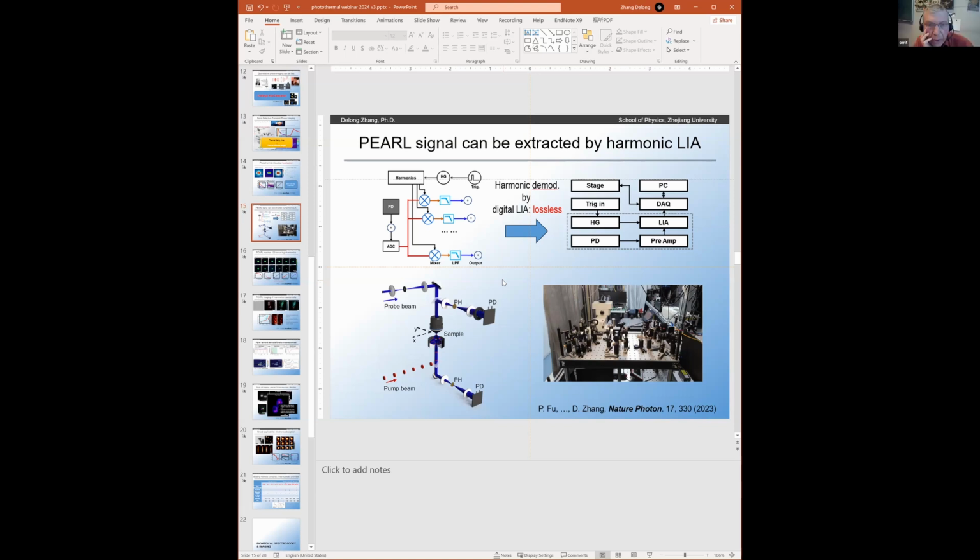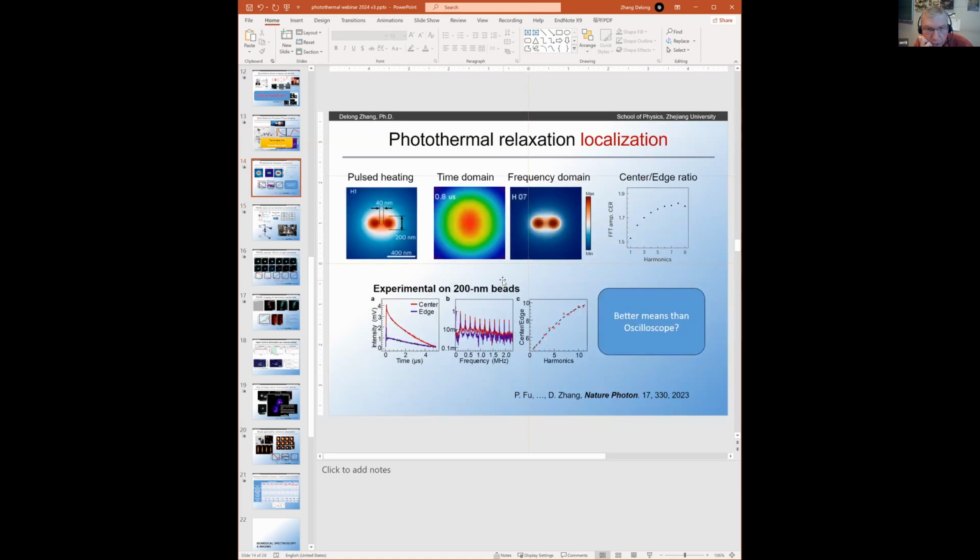Right. So I think the question was about the excitation mode, and your figure here on the slide shows that you have pulses of pump excitation. You have short pulses. Yes, very short pulses. So you go to very high orders of harmonics. If you have infinitely short pulses, you have infinitely many, because the thermal decay is exponential, so it can never be sinusoidal.